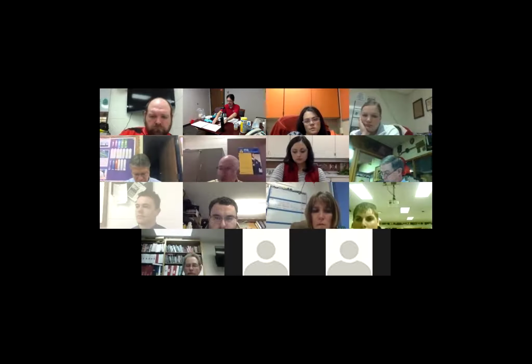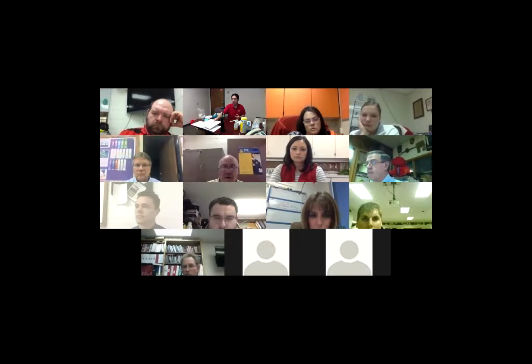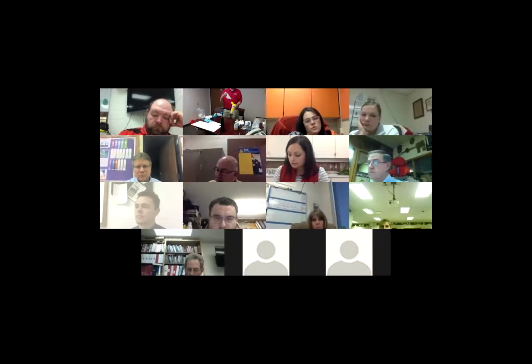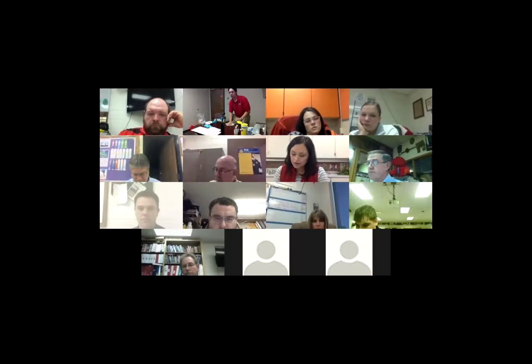Yeah. It is there. So one thing that I want to mention, I think is very important when you're working with the students in the classroom. We want to emphasize safety and proper sterile or aseptic technique when we're making this. So one of the things that I'm going to do here and that you should do in the classroom is use bleach wipes, and you always want to disinfect the surface. And it's going to tell you this in the instructions from Carolina and in the lab manual as well.